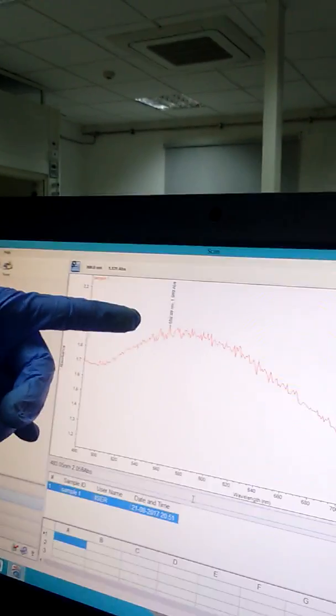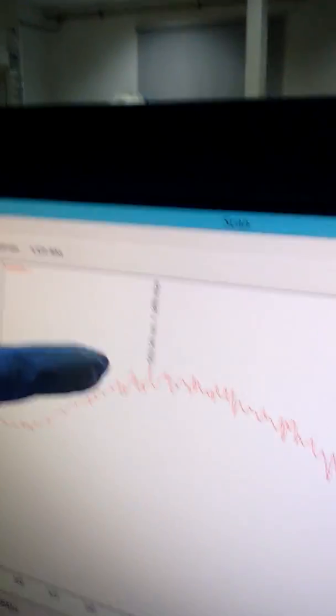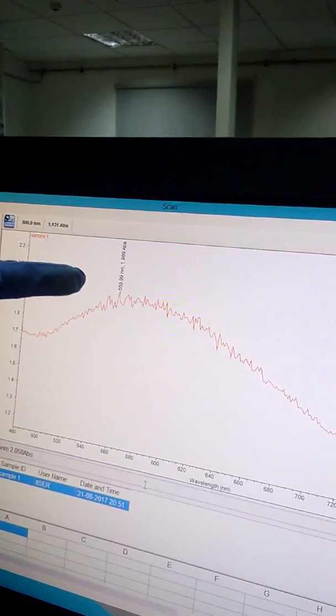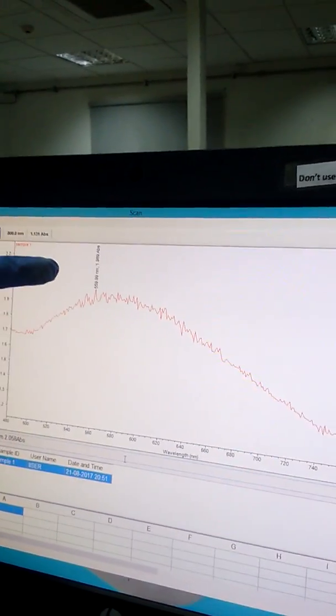Compare this lambda max value with the literature value. After that, calculate the size of gold nanoparticles.